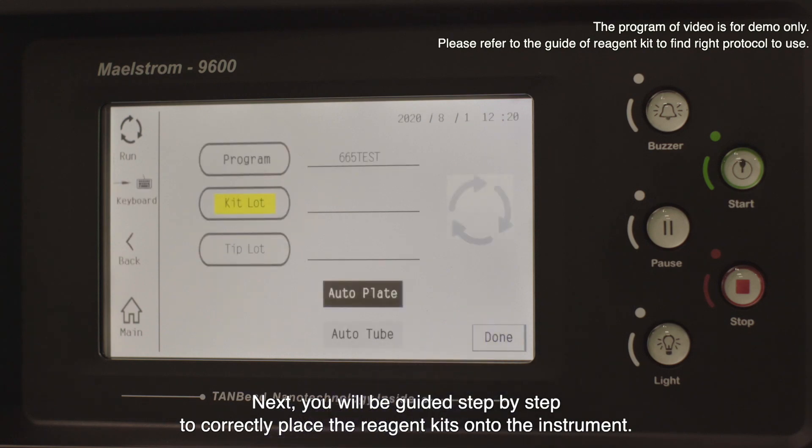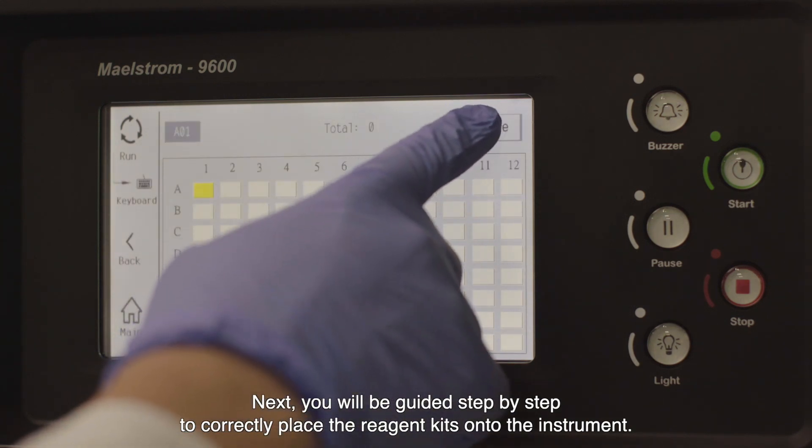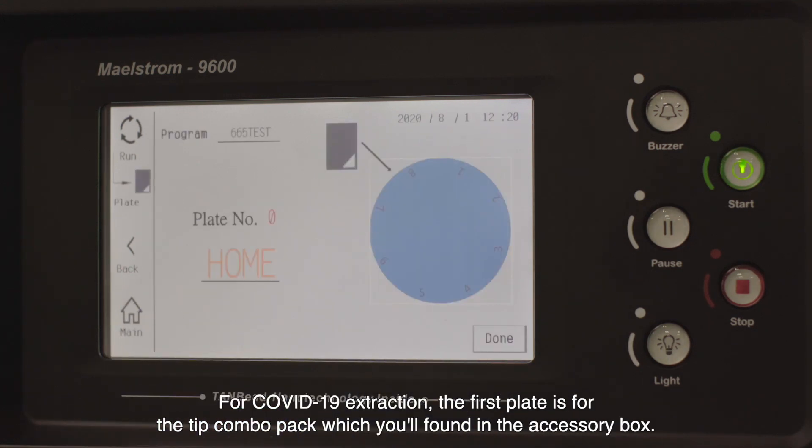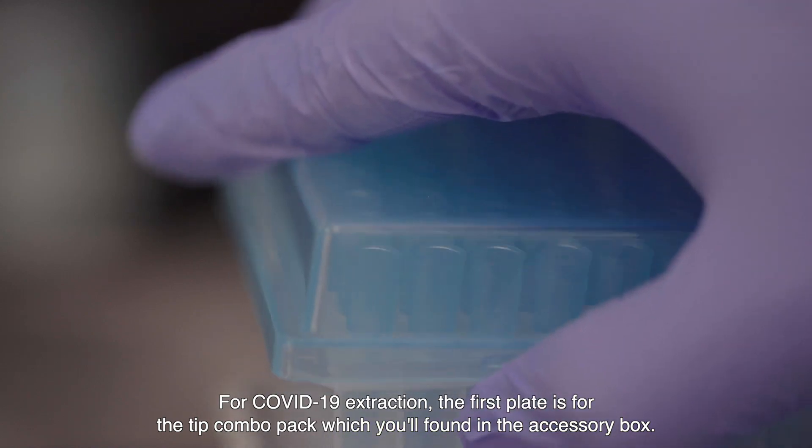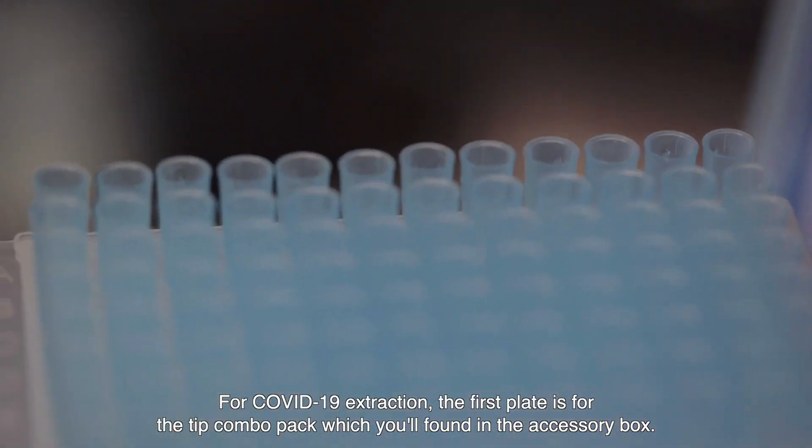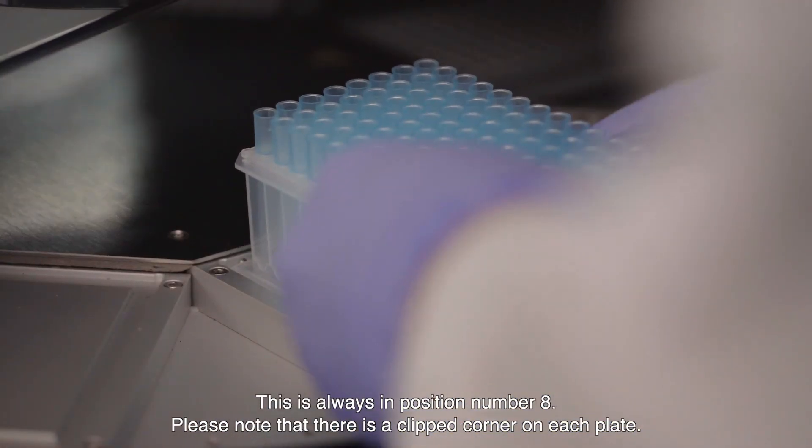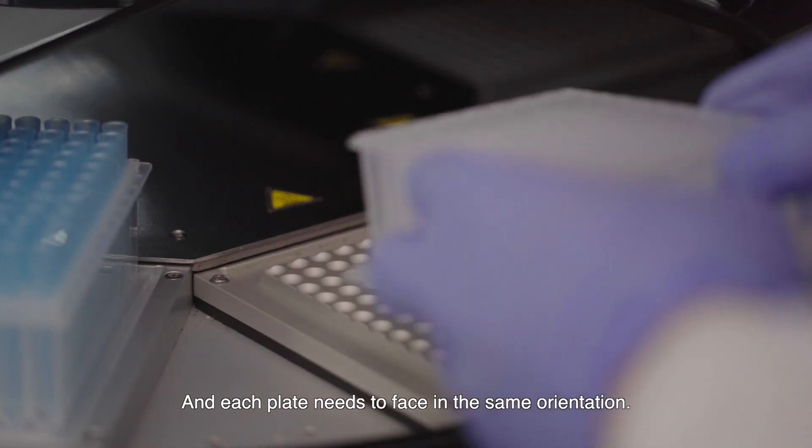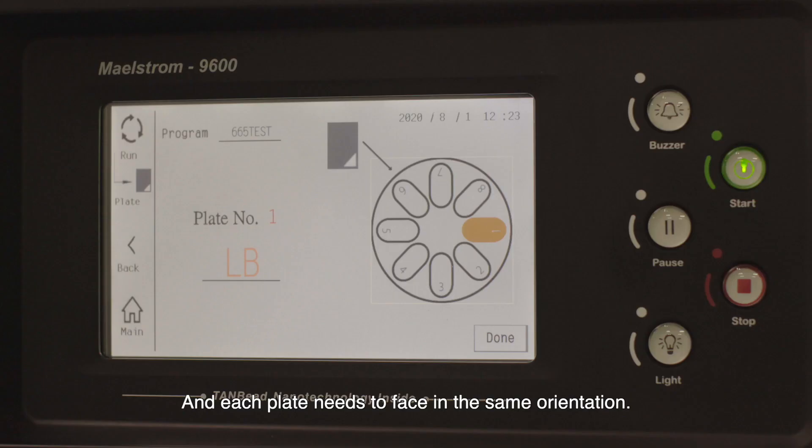Next, you will be guided step by step to correctly place the reagent kits onto the instrument. For COVID-19 extraction, the first plate is for the tip combo pack which you found in the accessory box. This is always in position number eight. Please note that there is a clipped corner on each plate and each plate needs to face in the same orientation.